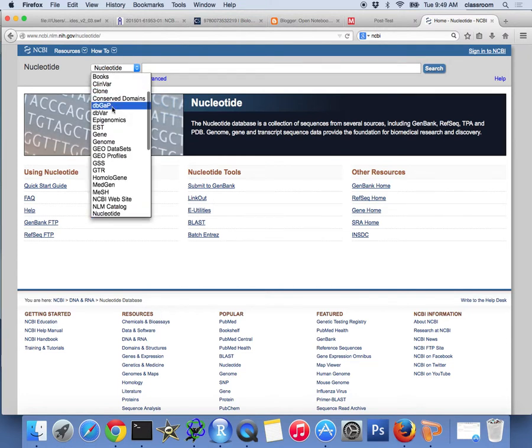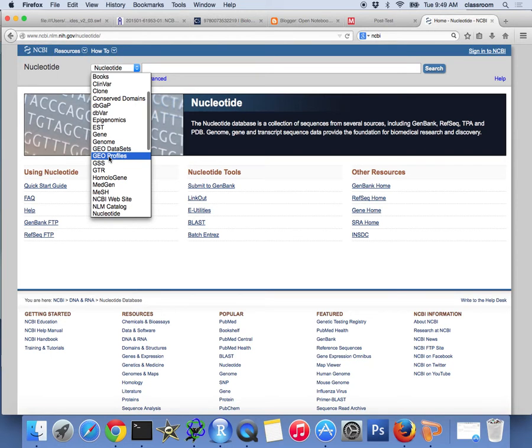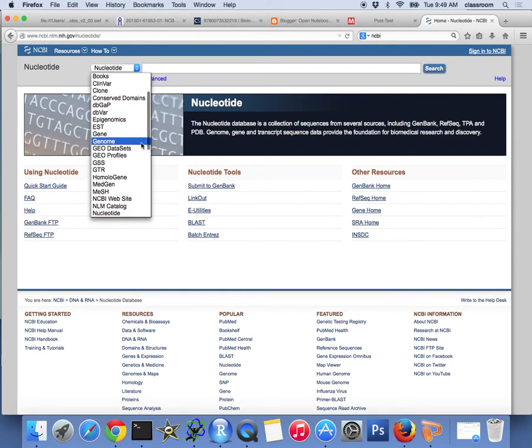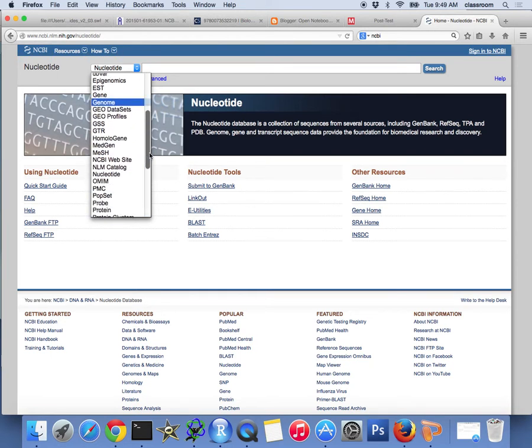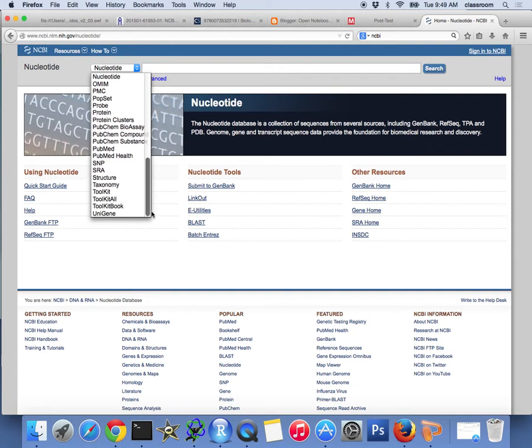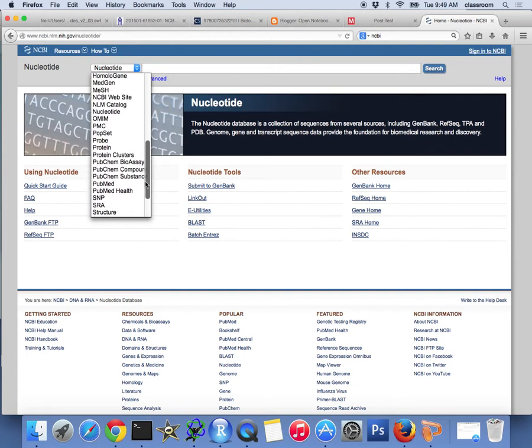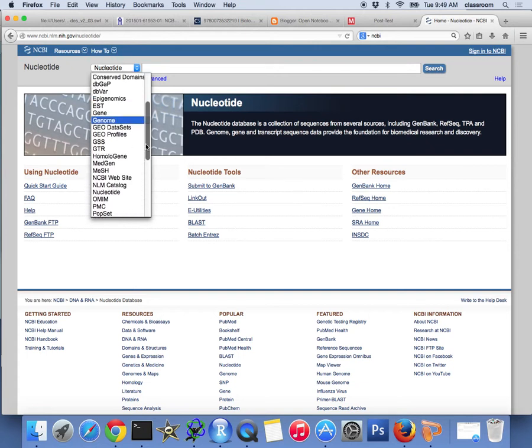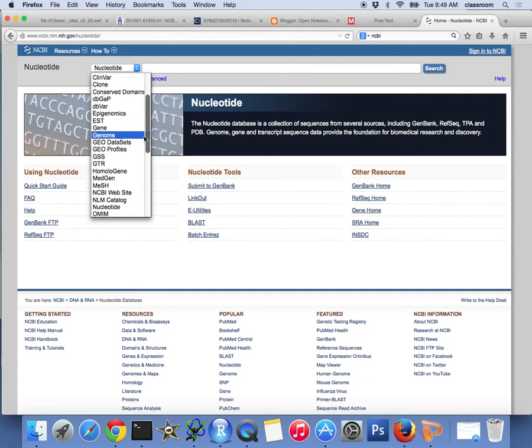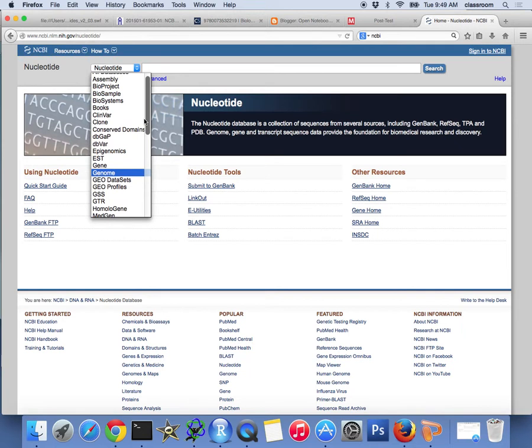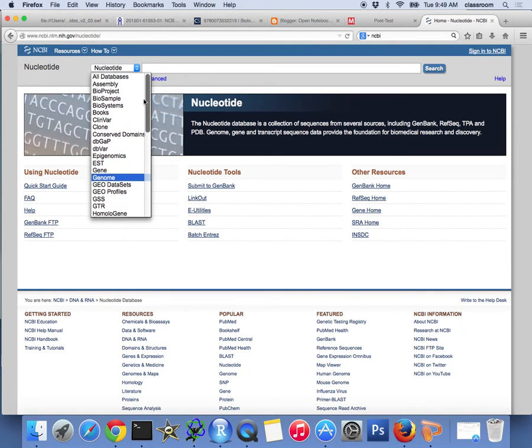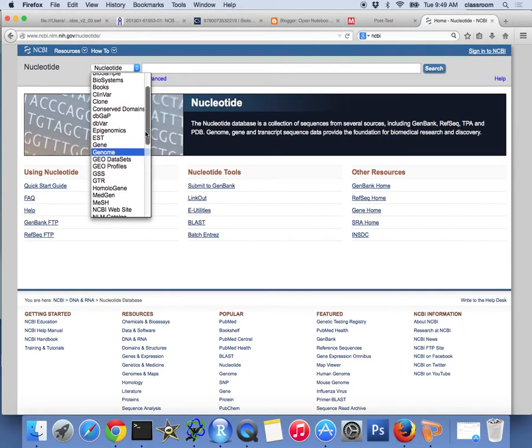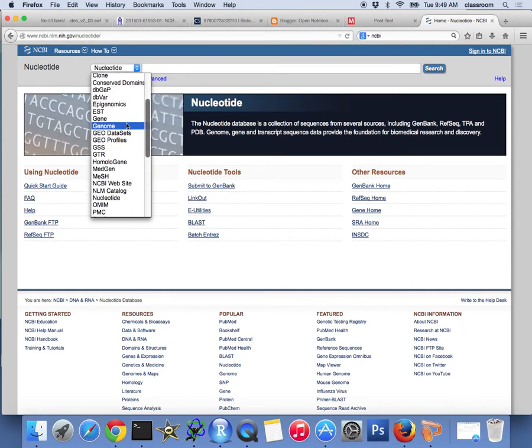So there are books, epigenomics, gene, genome, GEO, homology. There's a lot, right? So in fact, if you scroll down, you will see many, many useful information here. We actually also talk about PubMed on the first day of the class. But here we are going to use nucleotide.